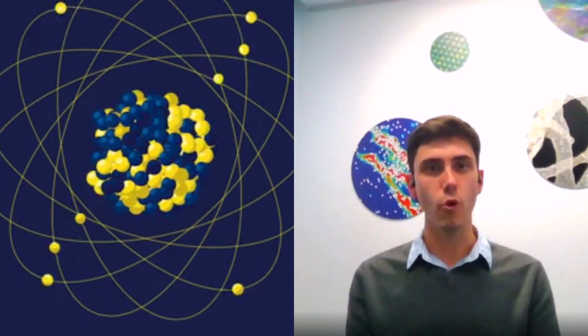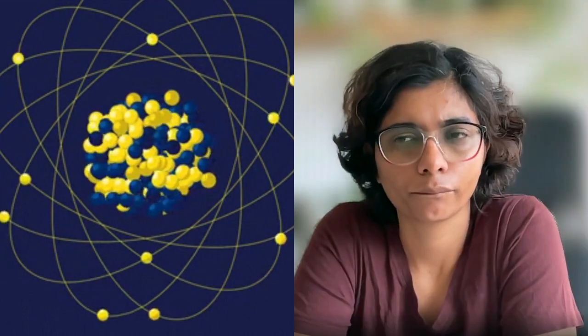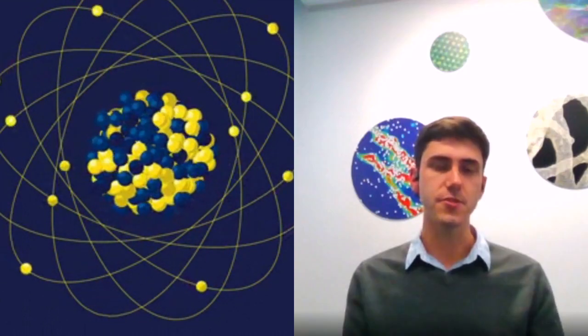You get data an atom, or at least a small cluster of atoms, at a time. Second, it's natively three-dimensional. It's not like tomography in the TEM, where you have to tilt the sample. In atom probe, the data is naturally in 3 dimensions. So together, it's 3D near atomic scale reconstruction.